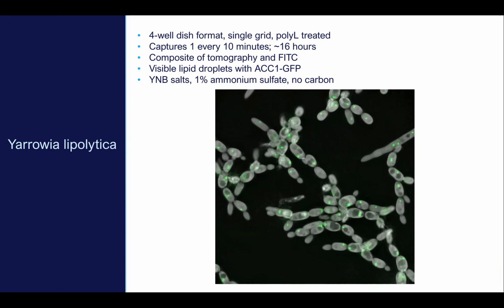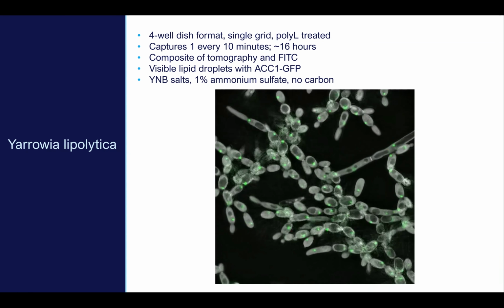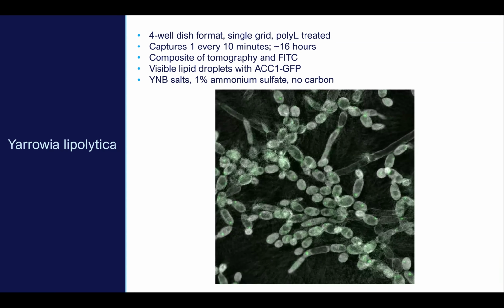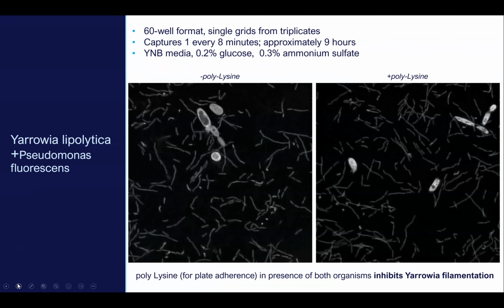What you'll see is one of the challenges that I'm going to highlight later, which is that the platform is best suited to thin layer samples. It was originally designed for adherent mammalian cells. So when you have a significant height, or things that would drift across the plane of image capture, that complicates the data collection. Things went a little bit out of focus late in the image, but some really interesting dynamics are available.